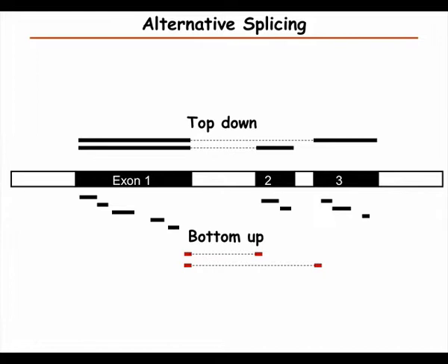But definitely there are questions that would be much easier to address with top-down. And now there have been a few groups working on this for quite a while, and there's more and more people working with top-down, and it seems there has been more and more technology development, so it's possible to do it.